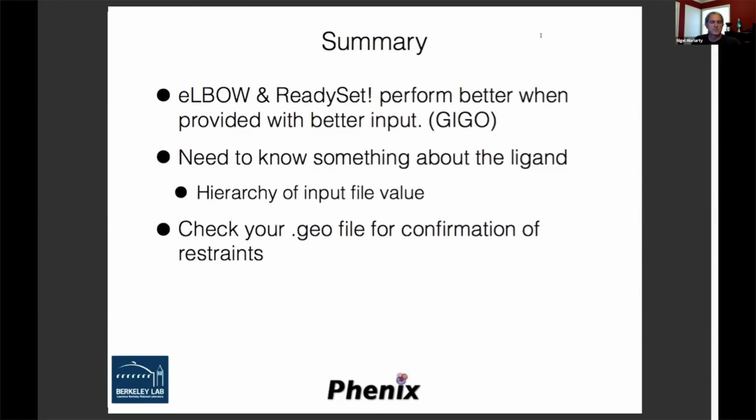That is probably because some of the restraints in Phenix are the old version, the version 2 version, that is on my agenda to get rid of. Your choice depends on which way you want to do it, but either Coot or Phenix will take the restraints from the other program and use them almost seamlessly.